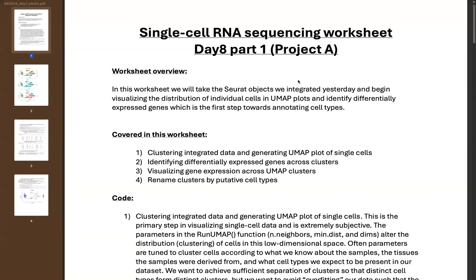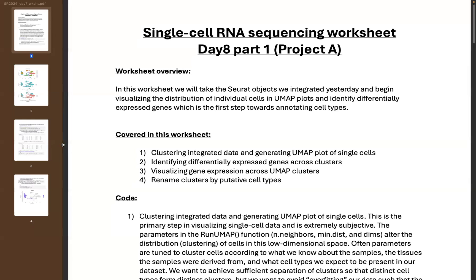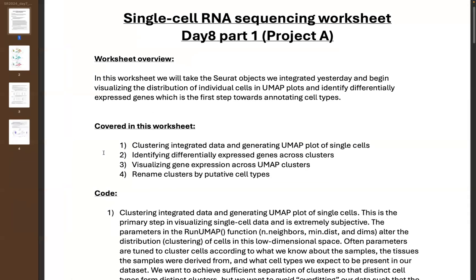Hey everyone. Today's video leads off from yesterday's class where we went through pre-processing of a Seurat object for single cell sequencing — we did normalization, scaling of the data, and integrated our Seurat objects. Now we get to the part of the single cell workflow where we actually generate single cell clusters, where different clusters represent different cell types, and then we'll try to identify those cell types through differentially expressed genes across clusters.